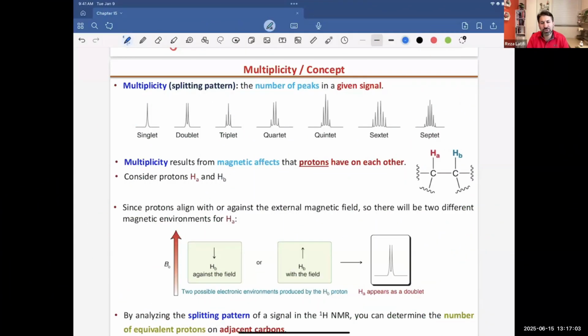Hello and welcome back. The fourth item that we need to study whenever we get an NMR spectrum is the shape of each signal. So you look at one specific signal and you ask yourself, is there any splitting? Do I see fine or small peaks attached to it? That is going to give you huge info about neighbor atoms and how many hydrogen atoms are attached to the neighbor carbon atom.